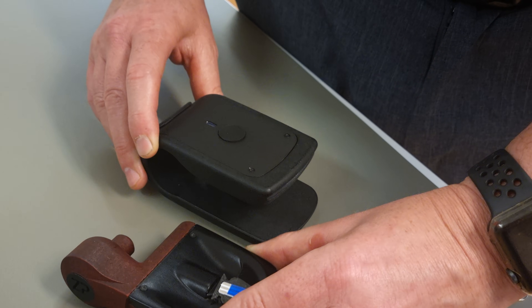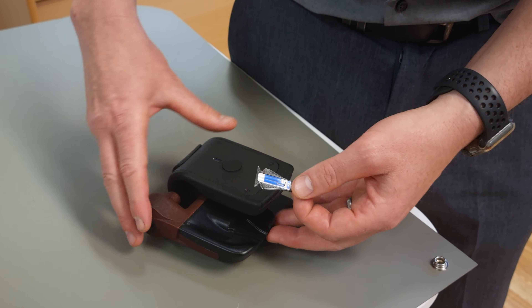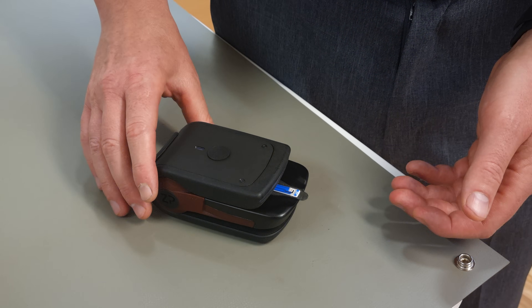And then really elegantly, it's cleanable. For some reason, if somebody spilled something, this is brought in by magnets — it mates really nicely. Let's slot that back in, and we're back into business.